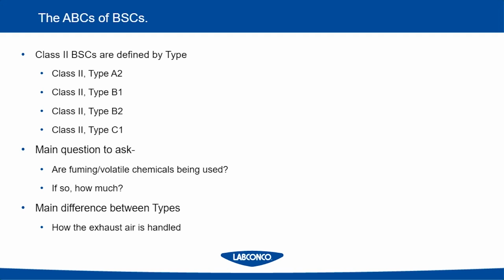The reason for that is that fuming chemicals are not trapped by HEPA filters. So let's say you had a process that involved some work with phenol chloroform. You would not want to do that in a standard recirculating biosafety cabinet that didn't have any exhaust, because those fumes would pass directly into the laboratory and be exposed to the users.